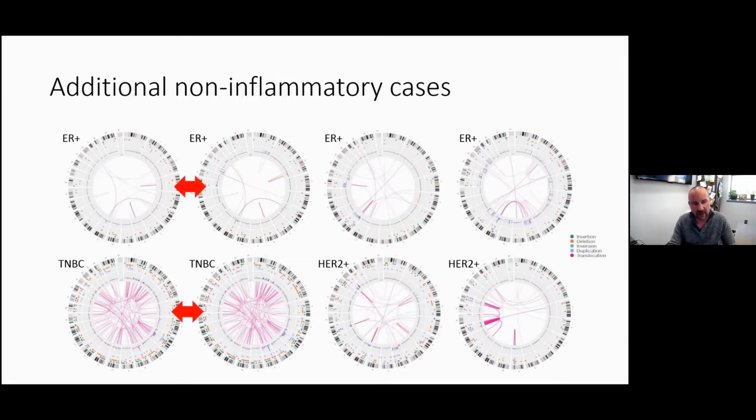Just really quickly going through the findings here, we accidentally included, I hate to say that, 2 different regions of the same tumor from the same primary resection that had different sequence ID numbers. So that's a little bit unfortunate, but it gave us a real opportunity to look at reproducibility of the assay going through DNA isolation, different regions of the same tumor, and then also the data analysis. So you can see the high, striking degree of similarity between those 2 samples, demonstrating some level of reproducibility.